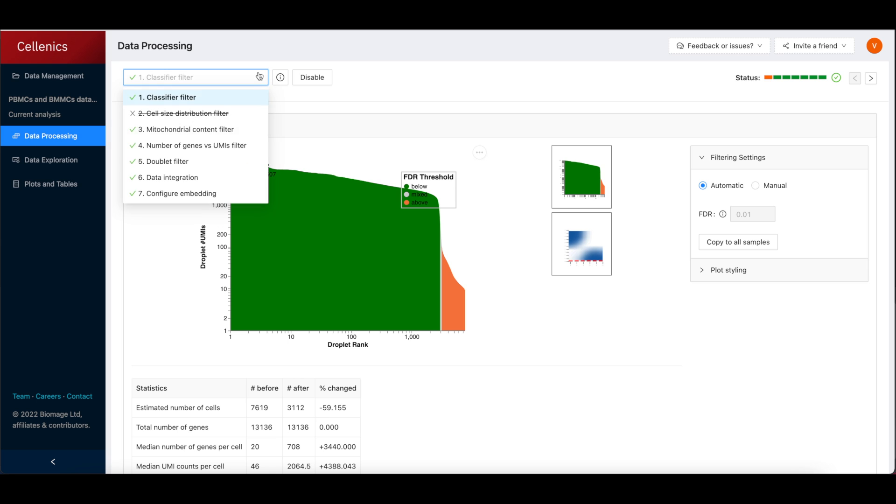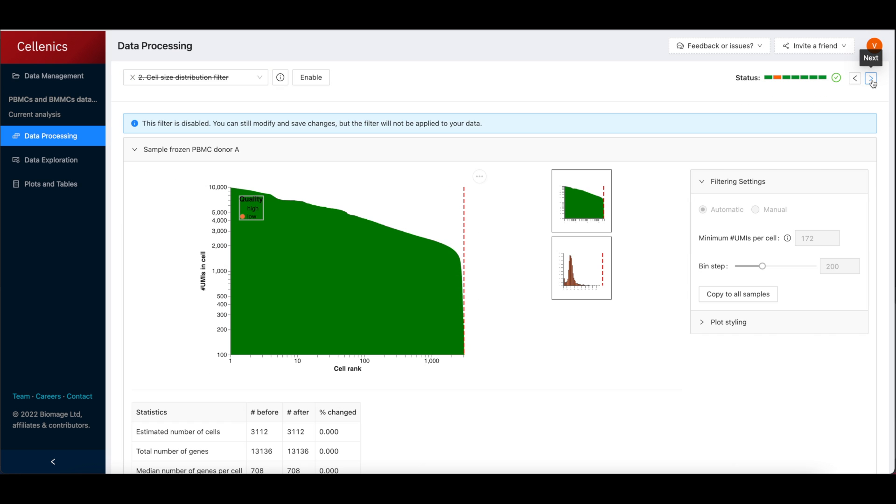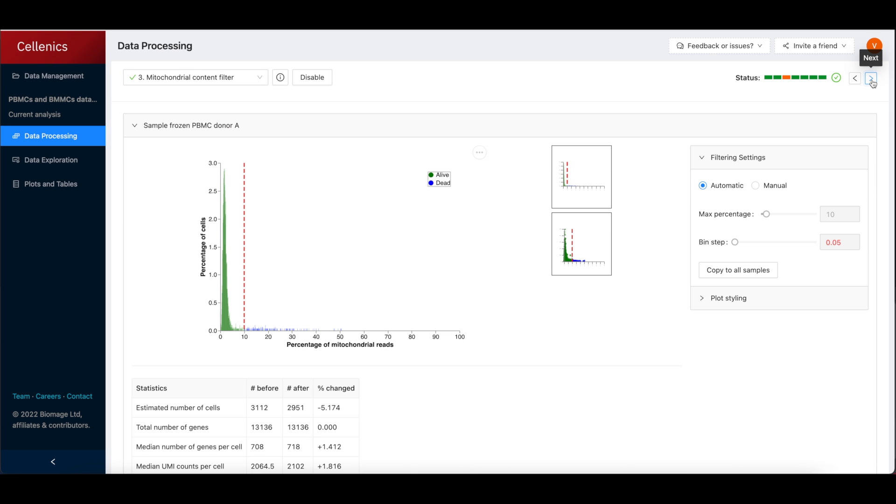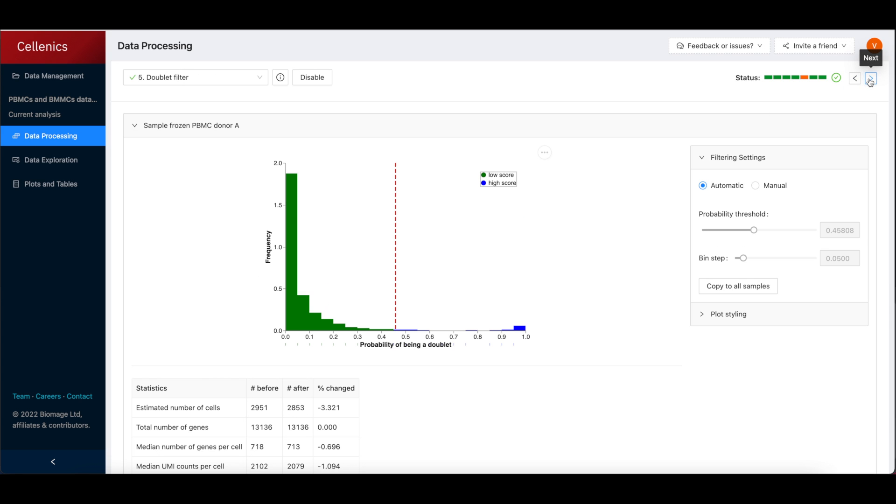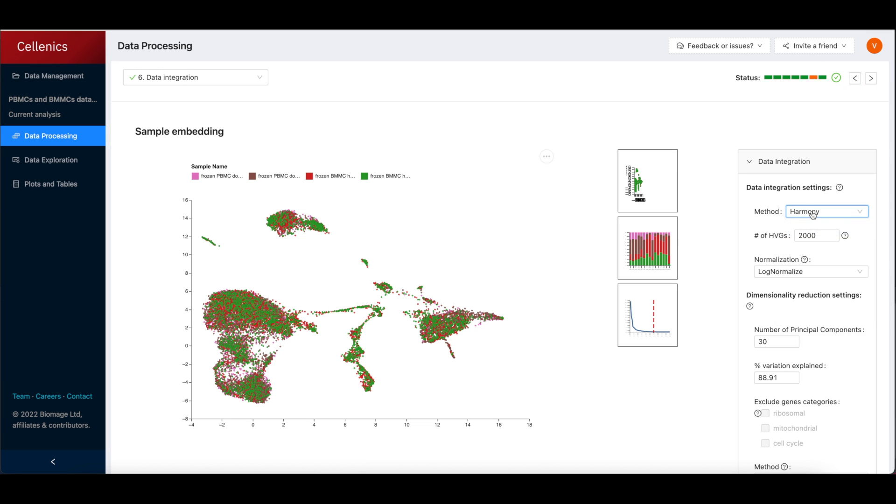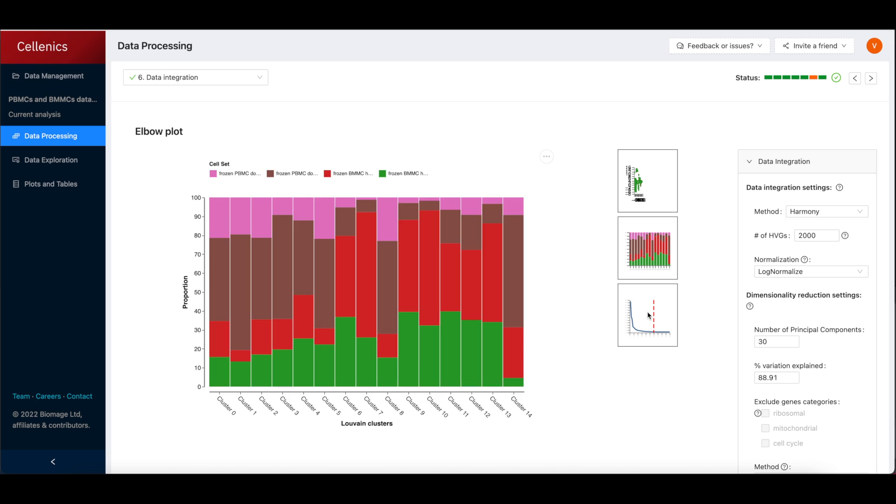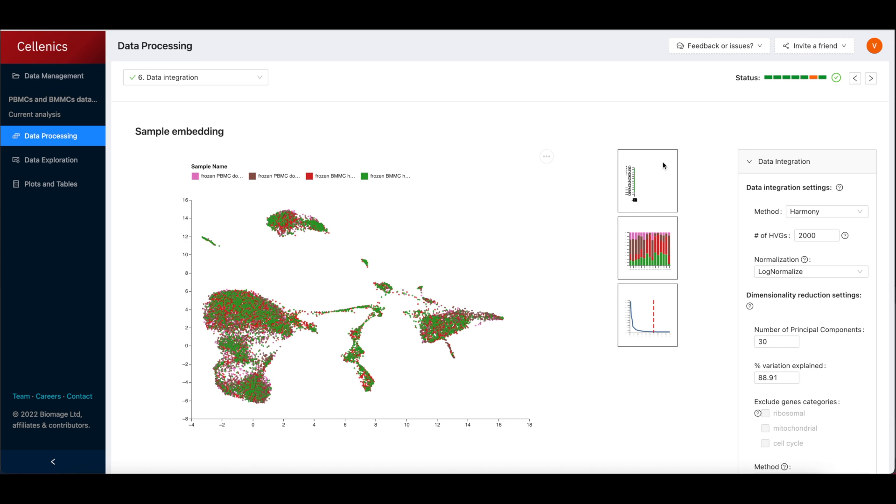The data processing module guides users through the essential cell filtering steps, including the removal of empty droplets, dead cells and doublets. Interactive plots allow users to visualize, customize and export these quality control graphs.